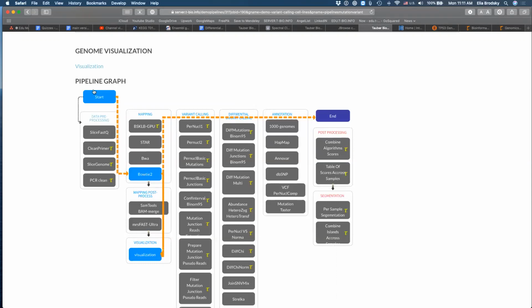So I have an alternative. Again, this is a demo. This is just first to illustrate one optional pipeline. Once you go into the Genomics 1 course, you will be given files to be able to create a pipeline. How do you know it's the correct pipeline? You have to understand the logic of the pipeline to be able to select the right function for the right logical step you have to do.